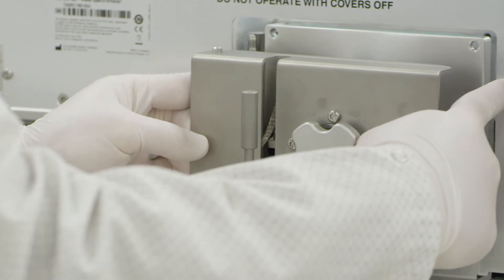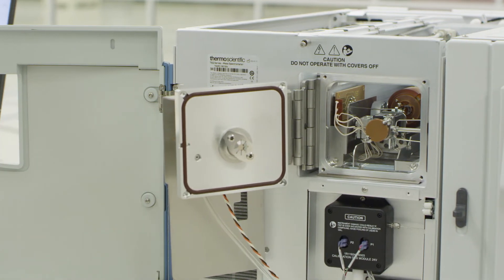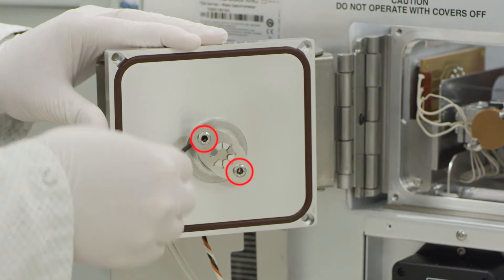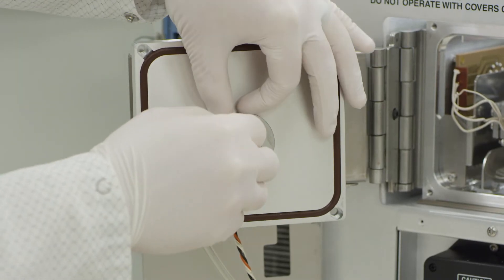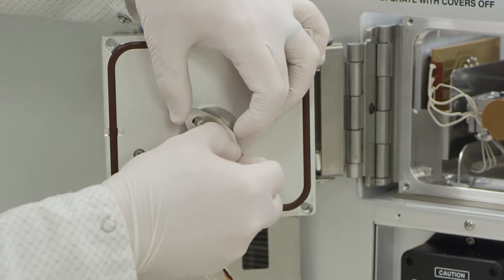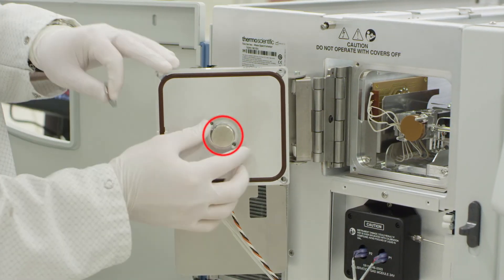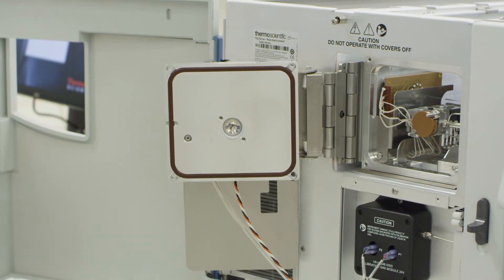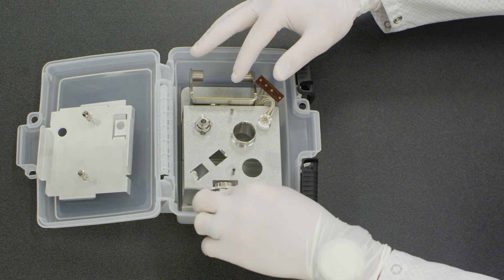Open the manifold as previously described to allow access to the front of the assembly with the AEI source currently installed. Remove the post holding the AEI source magnet in place. Take special caution when handling this magnet — these are strong magnets. Keep at least 6 inches or 15 centimeters away from sensitive electronics and medical devices. Place the magnet and shield in the designated location in the source box.